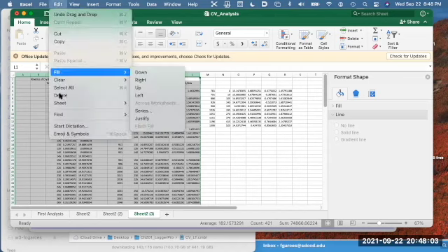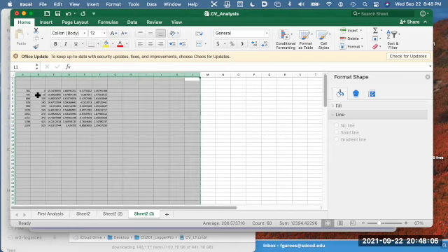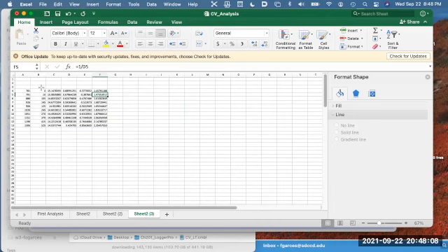So what I'll do here is I'll just delete that, and then I'm going to give these proper headings. Oops, that's incorrect. The first column there should be time, then absorbance, natural log absorbance, and 1 over absorbance. Now that I have that, let me go ahead and generate the graph of absorbance versus time.